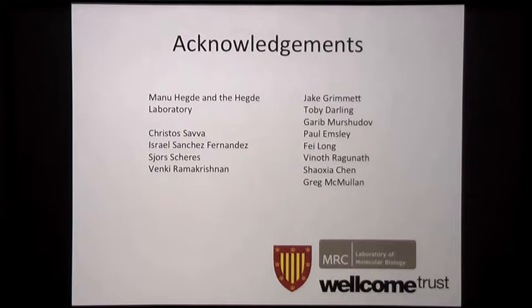And so with that, I think hopefully I've shown you that EM can be a very powerful technique. Sometimes it can go very quickly, and hopefully it can allow you to study interesting complexes that would be intractable by most other methods.